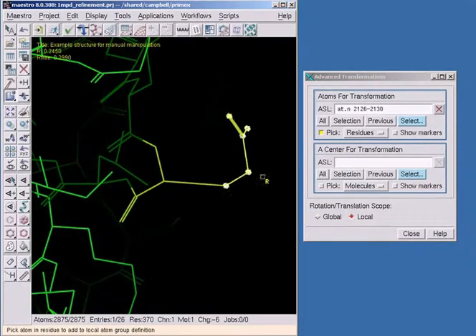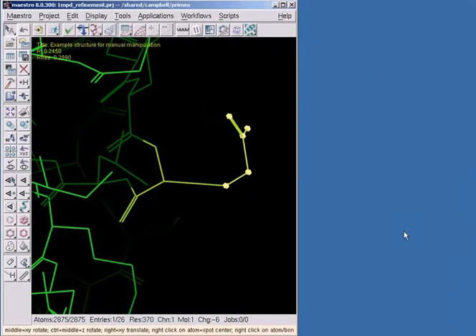Finally, we'll manipulate the selected atoms just as we would change the workspace view. So once we're satisfied with the placement, we can turn off local transformations by closing the Advanced Transformations panel. To clean up the geometry without regard for density maps, we can simply click on the soap bar icon in the Primex toolbar.